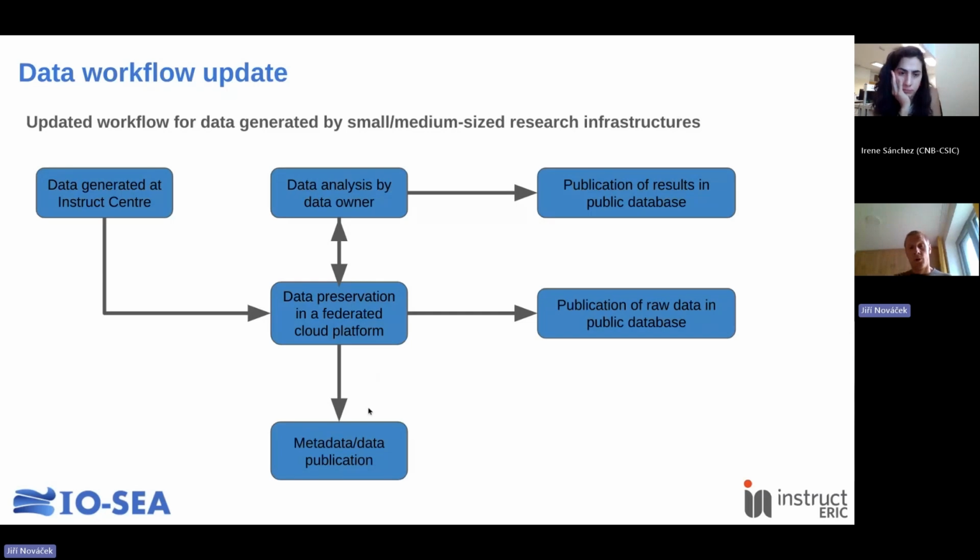Primarily, in our case, we are not working with a database that is dedicated for EM data, which is EMPIAR, but that is something that I'll show in the end as an outlook, and we are using a more general database for the scientific data that is available.